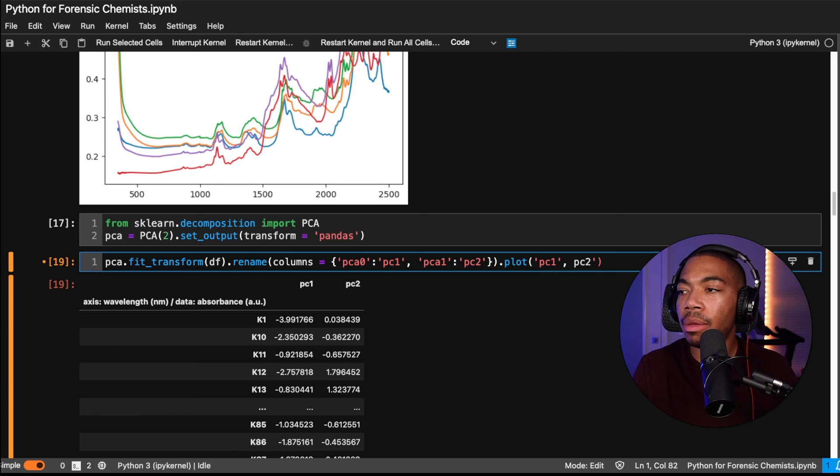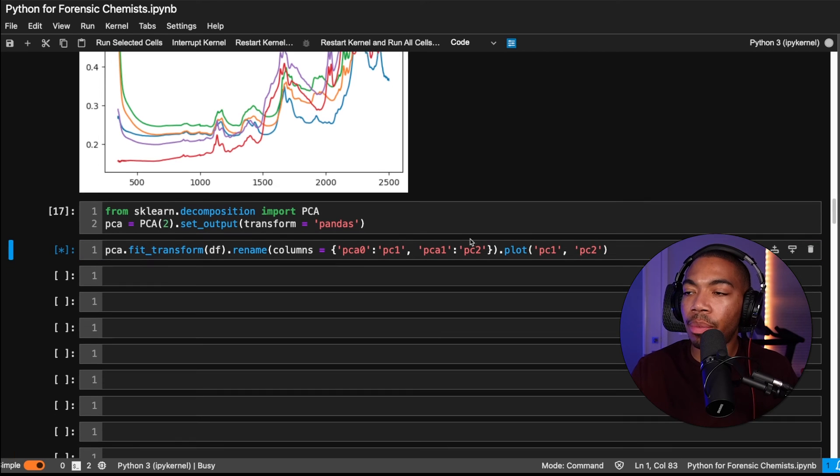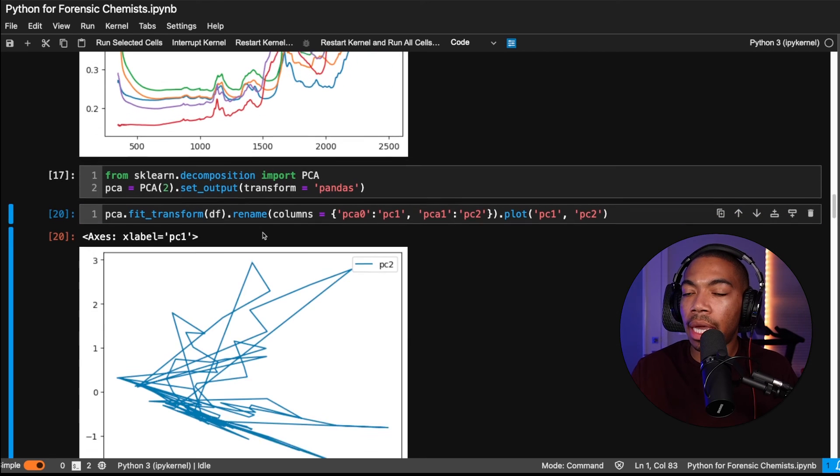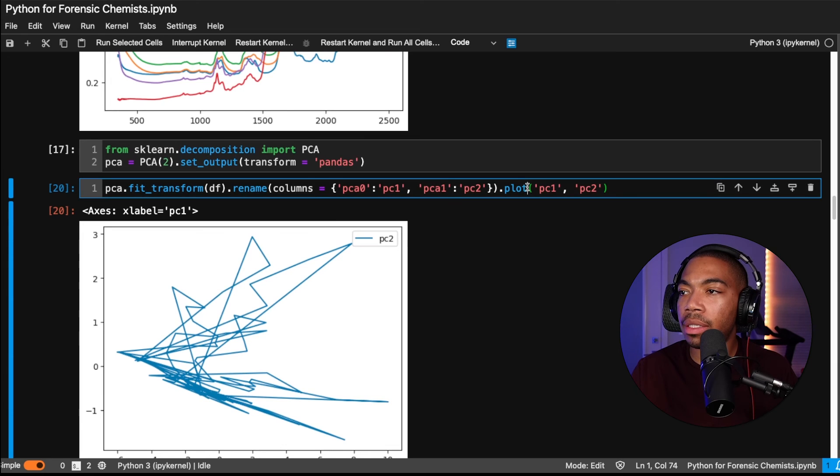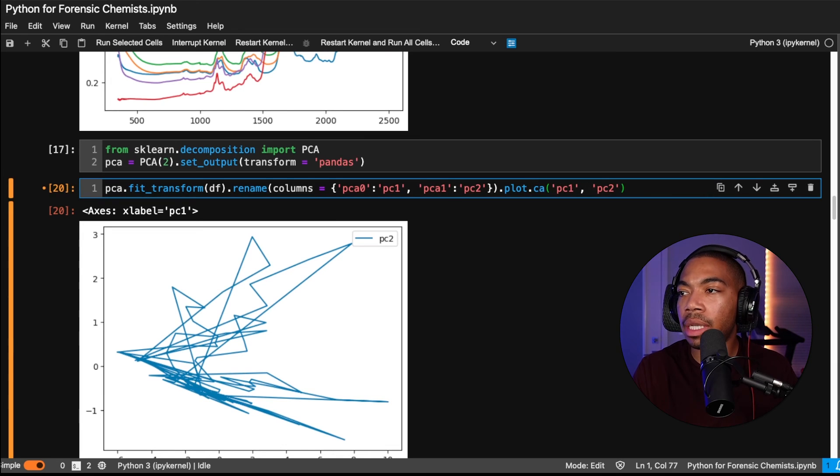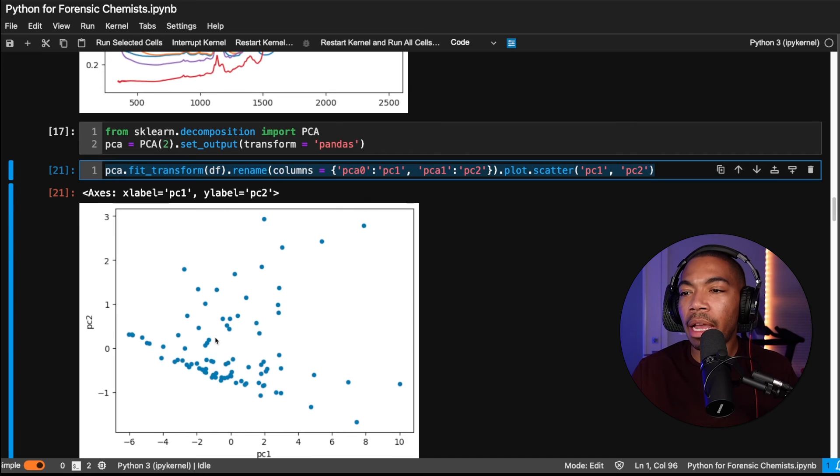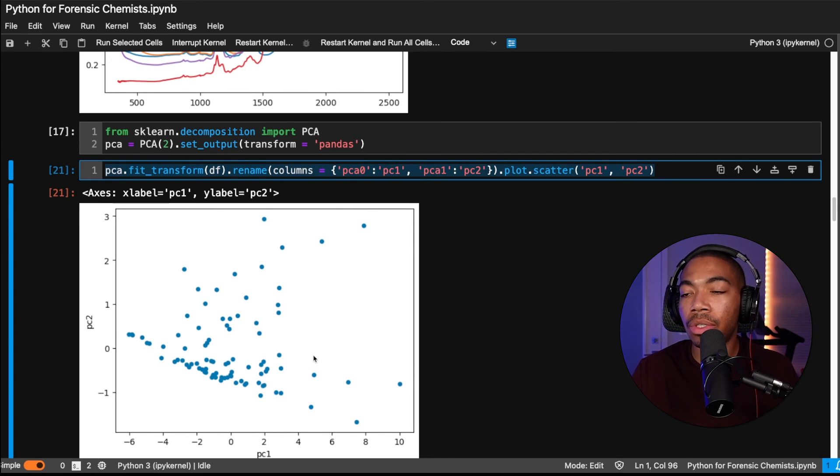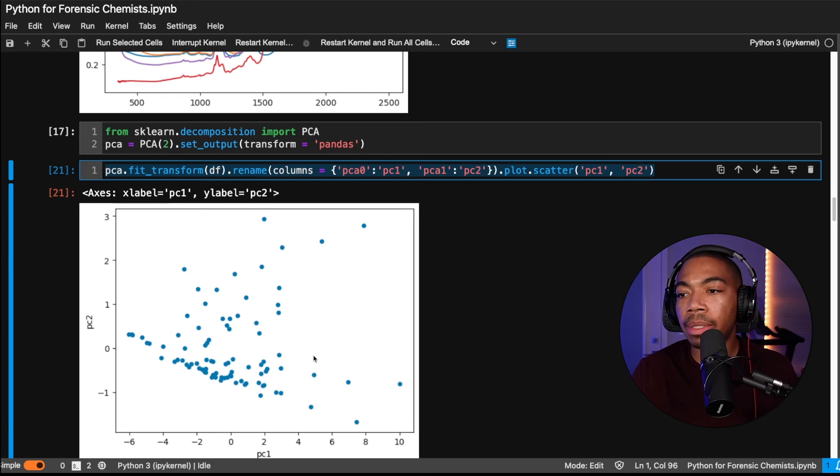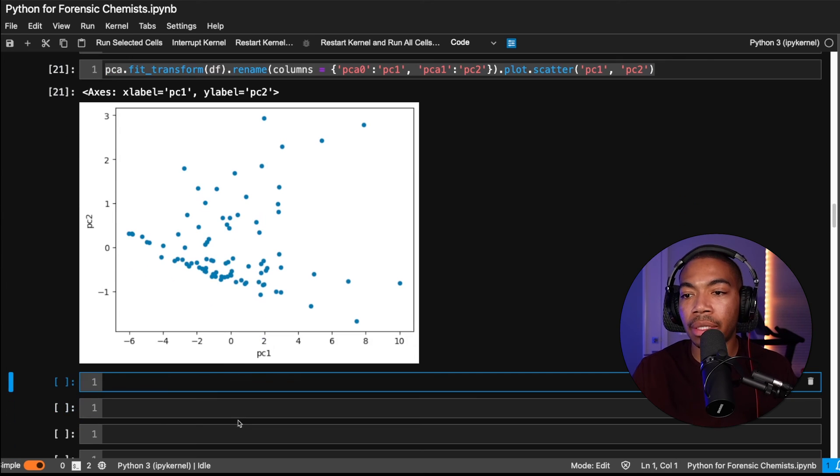And let's set, instead of this, let's do scatter. So here, we can see with the data frame, there might be some structure, but it's a little obscured. And this is largely due to some of the clutter that comes in with the data set that was not preprocessed.